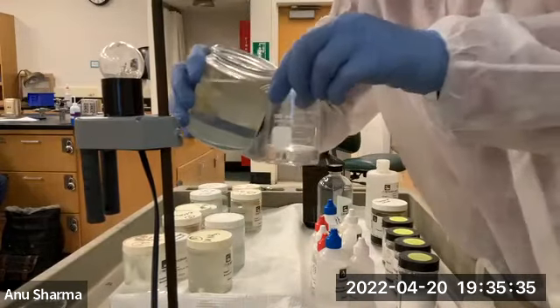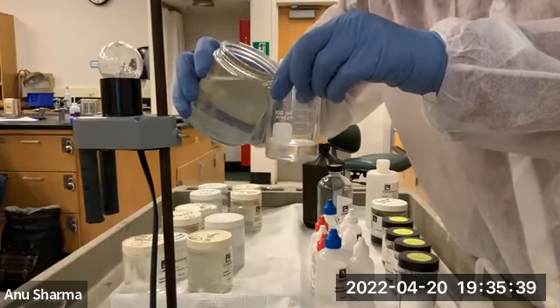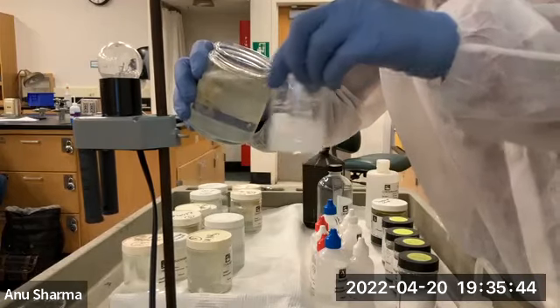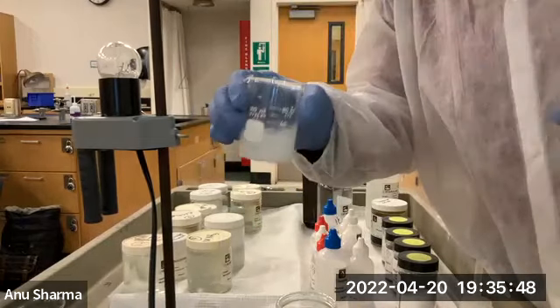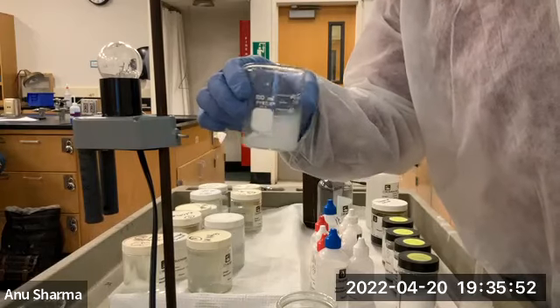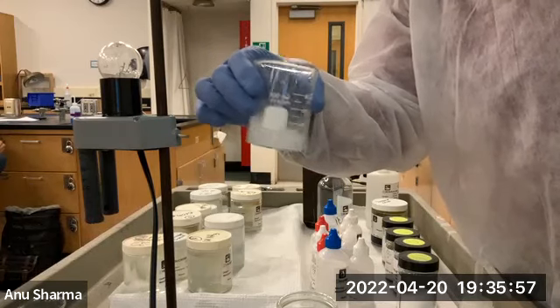Mix the two. What do you see? What is this now? Cloudy. Cloudy, yes. And why is it cloudy?